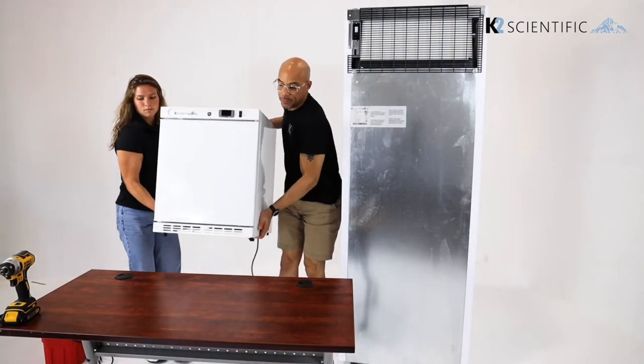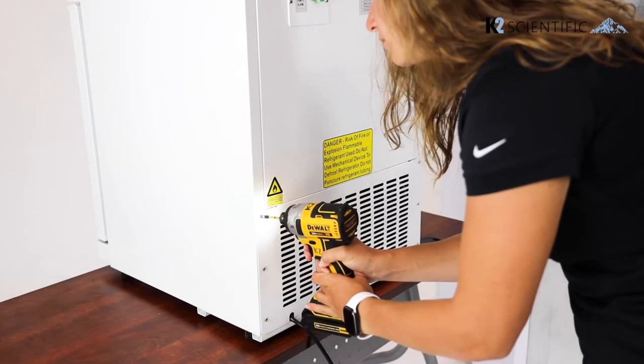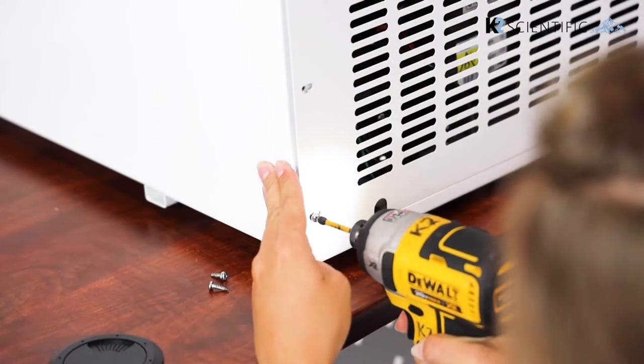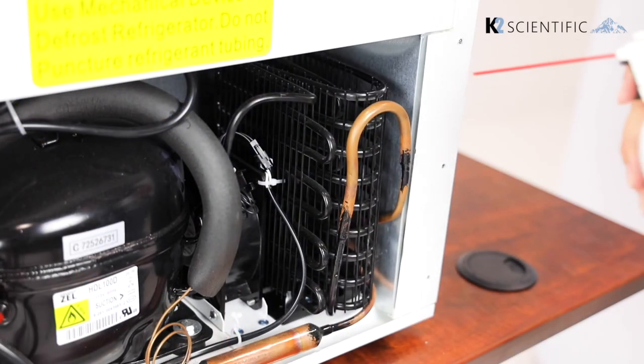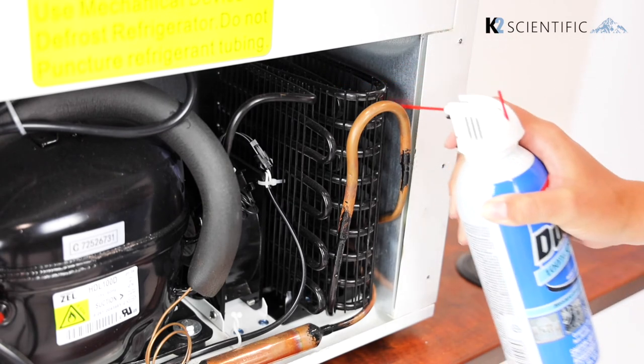If you're going to clean the condenser on an undercounter unit or a smaller refrigerator, it's easier if you place it on an elevated surface like a table. To access the condenser you may have to unscrew a panel on the back of the unit. As you can see with this refrigerator, there's not enough space to get a cleaning brush in — that's where you can use compressed air to blow the dust free from the condenser.